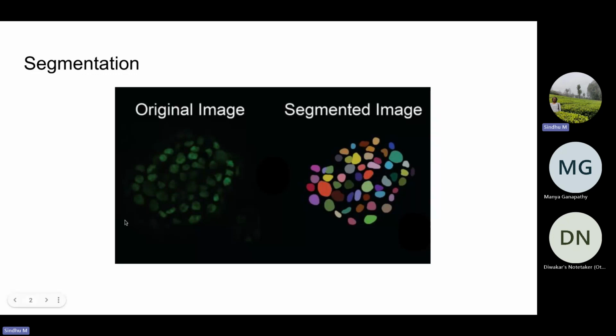But there are many microscopy images where there are many cells in the same image. Also, you might have many different images, so it may not be possible to sit and do it manually. That's why there is software that can automatically segment the cells or nuclei or whatever is in your image, and it gives you the cell outlines and an output mask like this. We'll talk more about what exactly this output represents and how it is saved in the upcoming slides.